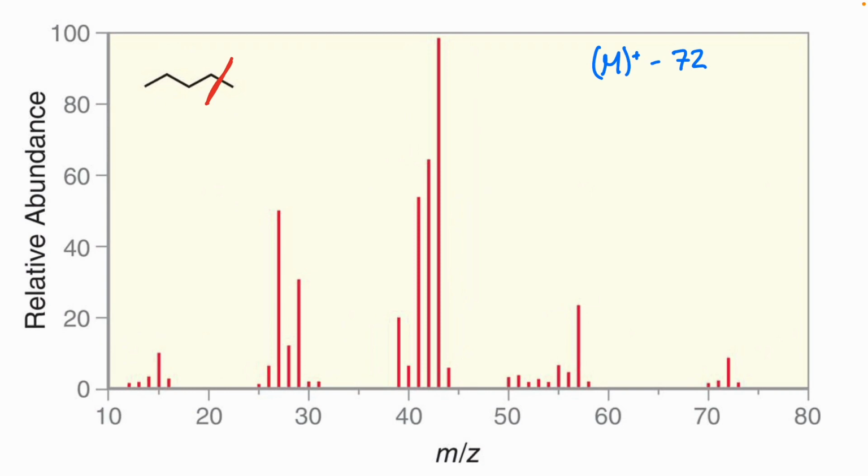I would take my molecular ion and I would have to subtract what? What would I be taking off to take off a methyl group there? Carbon and 3 hydrogens, which is 12 plus 3, 15. All right, so what often happens is we see this little spaced out pattern here. This cluster here is going to correspond to the M-15 group, right? Losing a methyl group. So M-15 means we lose a methyl group.